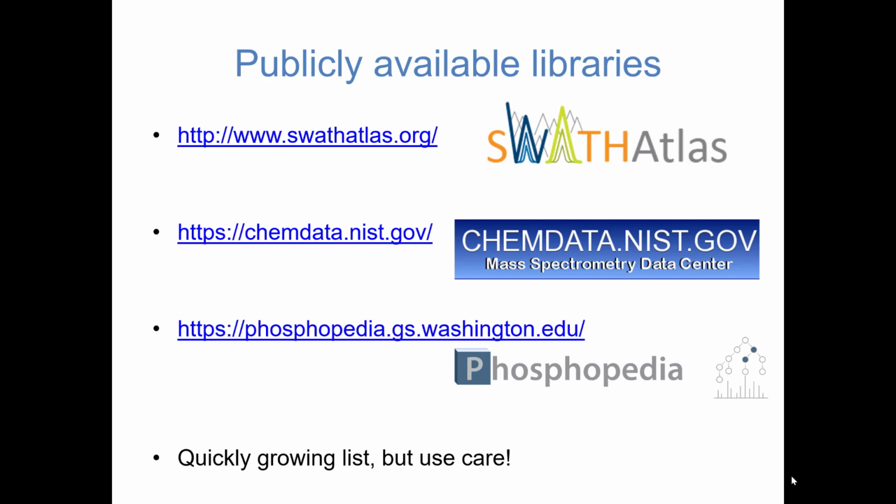You can take a QTOF library. The Pan-Human library is a QTOF library. You can apply that to a QE or to a Lumos, not a problem, as long as it's beam type fragmentation. If you're using CID fragmentation, you're basically just as good off if you had thrown away all the fragmentation data already. You get very little out of it, to be honest. But the CID and HCD fragmentation patterns are very similar.